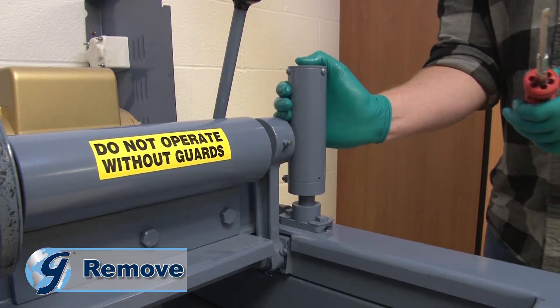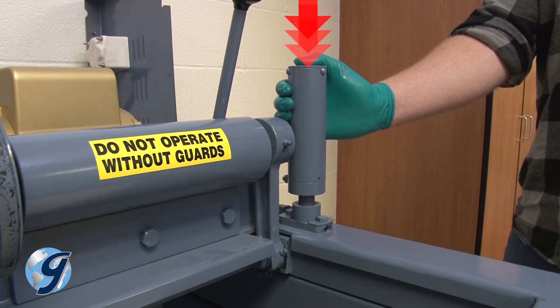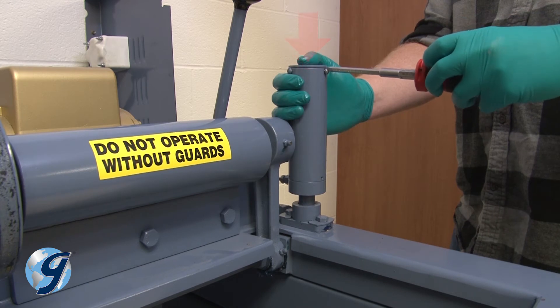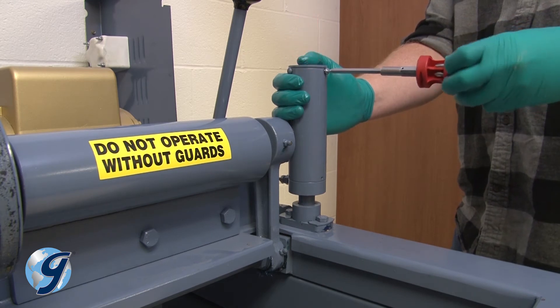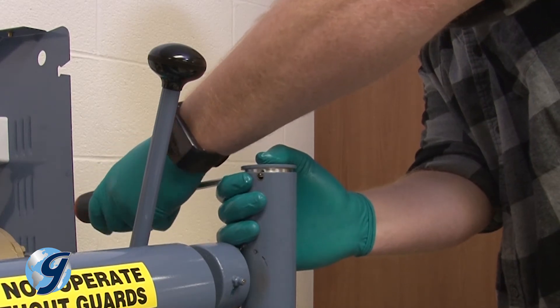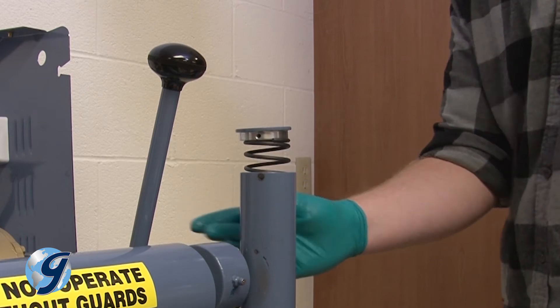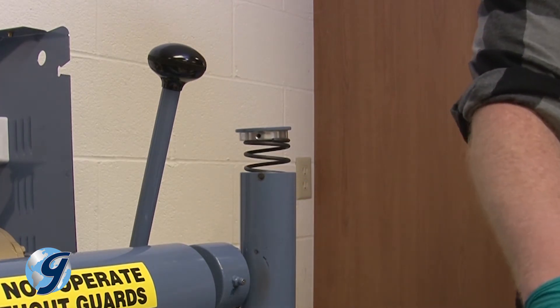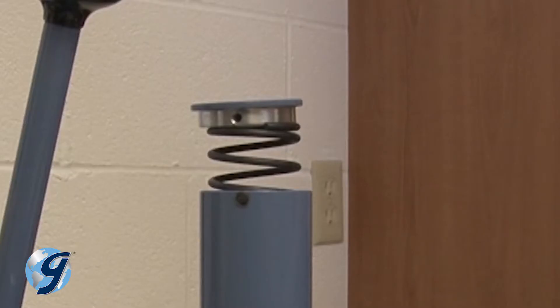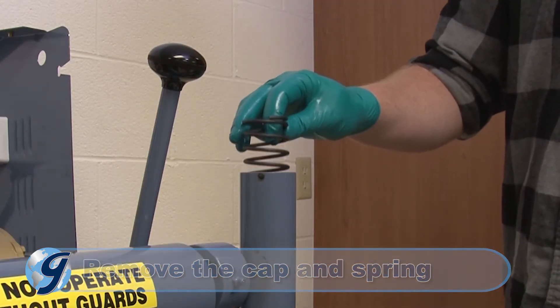Next, we are going to remove the cylinder cap. Please note that there is a compressed spring behind the cap, so caution is required when removing the cap. Keep pressure on the cap with your hand as you remove the three screws. Now, release the pressure of your hand slowly so that the compressed spring does not suddenly pop out.